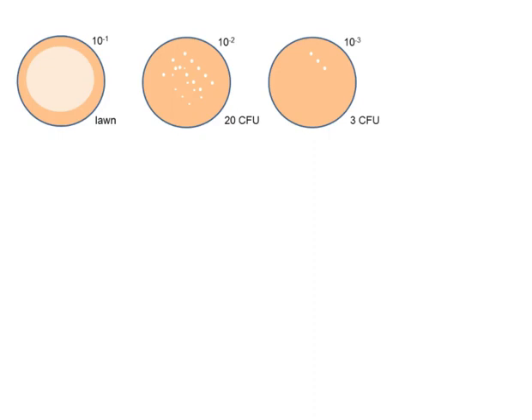So as promised, this is the calculation that I did in the last lecture that I saw you of how to determine colony forming units per mil from serial dilution plates. So I've made an example, as you can see here, where we have a series of 3 dilutions for us to work out the number of colony forming units per mil from. So that's really important, that we want to work out the number of colony forming units per mil. So I'm going to write that up there to remind us of that as we go along.